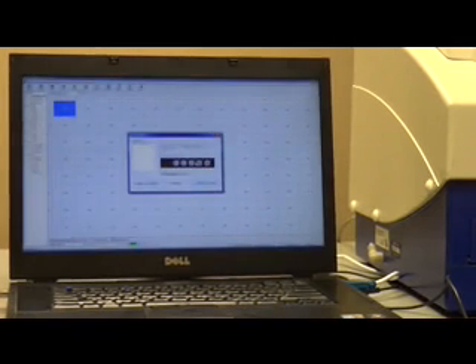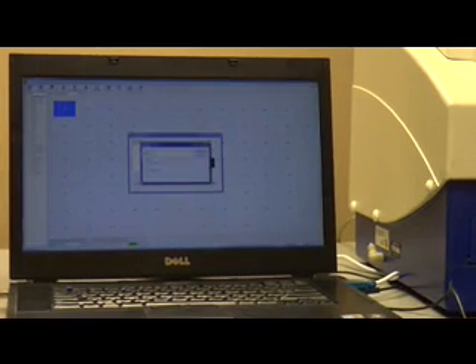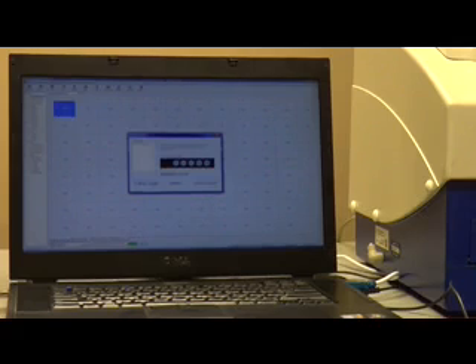Then all we do is drag and drop it into position two. Once that is done, click OK.